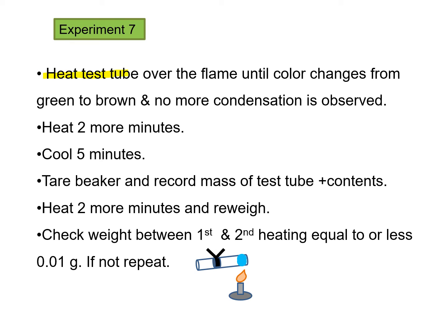Heat your test tube over a Bunsen burner flame, holding the test tube in a horizontal position. Heat it until the color, which should be green, changes to brown — this tells us the water is being released. Once it goes completely from green to brown, all of the water has been released. You'll see condensation forming on the test tube and steam coming out. After the color change, continue heating for two more minutes to ensure all water is released.